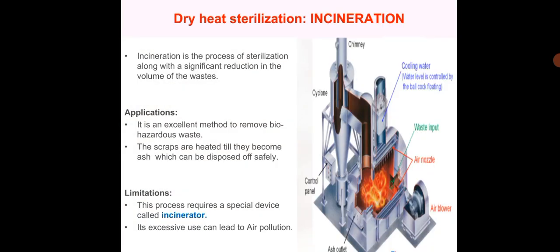Incineration. Incineration is the process of sterilization along with a significant reduction in the volume of the wastes. It is an excellent method of removing biohazardous waste. The scraps are heated till they become ash, which is then disposed of safely. This process requires a special device called an incinerator, but its excessive use can lead to air pollution.